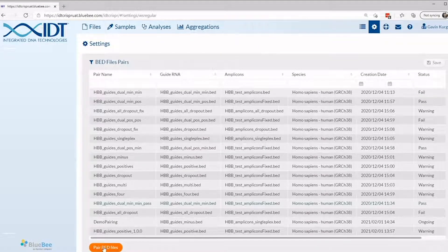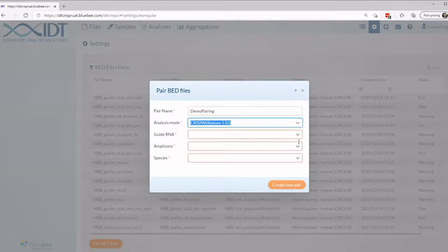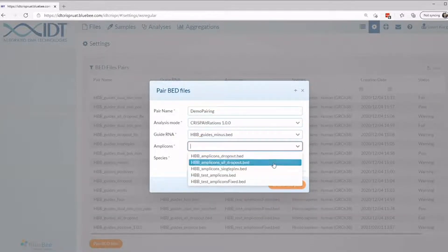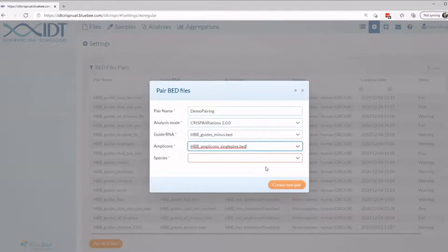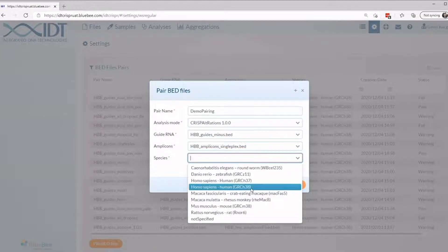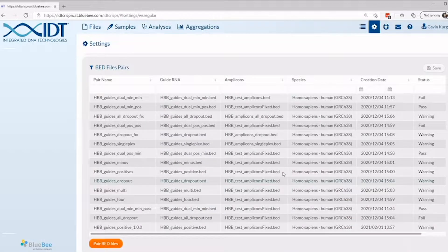To begin, select the orange pair bed files button. Give a unique name to the files being paired. Choose the pipeline version being used, the guide and amplicon bed files, and select the species these coordinates can be found in. This will begin to QC check the files and will take approximately 5 to 20 minutes to complete.